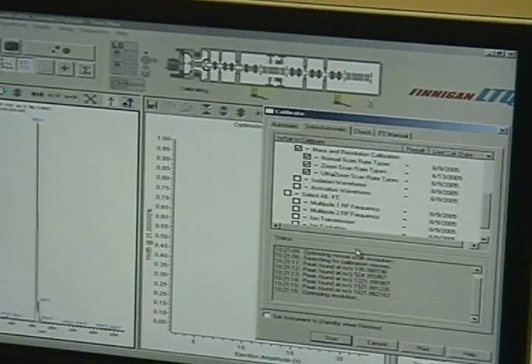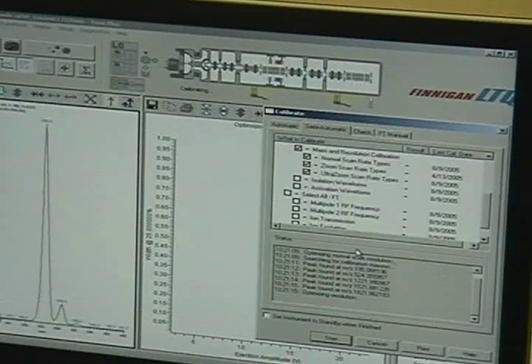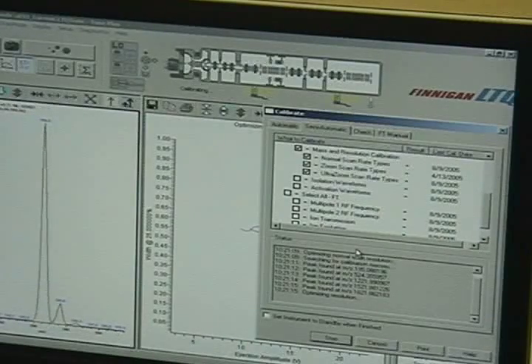And what I wanted to do is keep an eye on this just to make sure. Remember how I had that little junk peak? It didn't grab it. So now you memorize all these masses and you know what that is? That's a loserville.